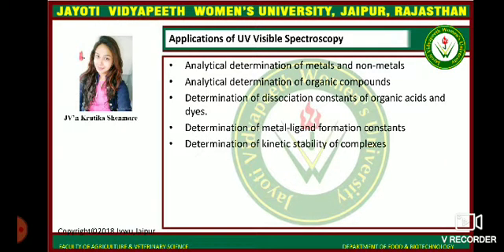Applications of UV visible spectroscopy. Analytical determination of metals and nonmetals, analytical determination of organic compounds, determination of dissociation constants of organic acids and dyes, determination of metal ligand formation constants, determination of kinetic stability of complexes.